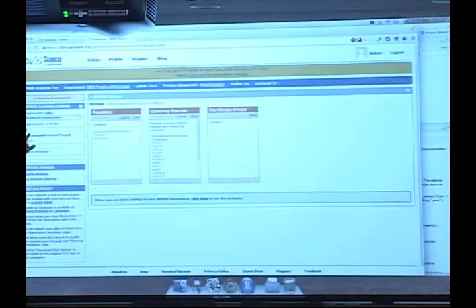So here's where you can set the target number of nodes that you're going to be clustering towards. This is where you can set the downsampling target percentage. They're kind of over here. I wouldn't worry too much about setting or changing those parameters. These are usually the things you need to select in order to run.